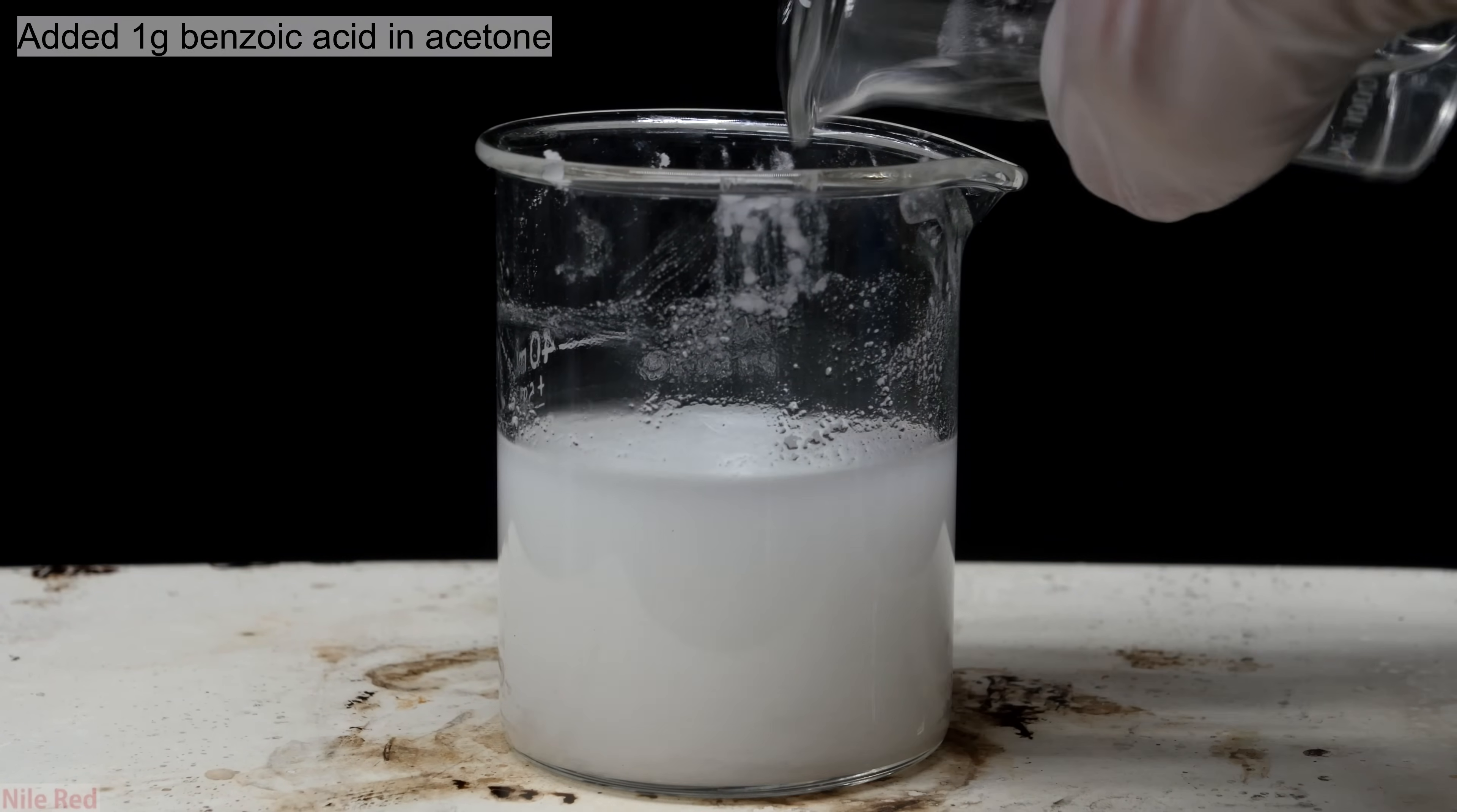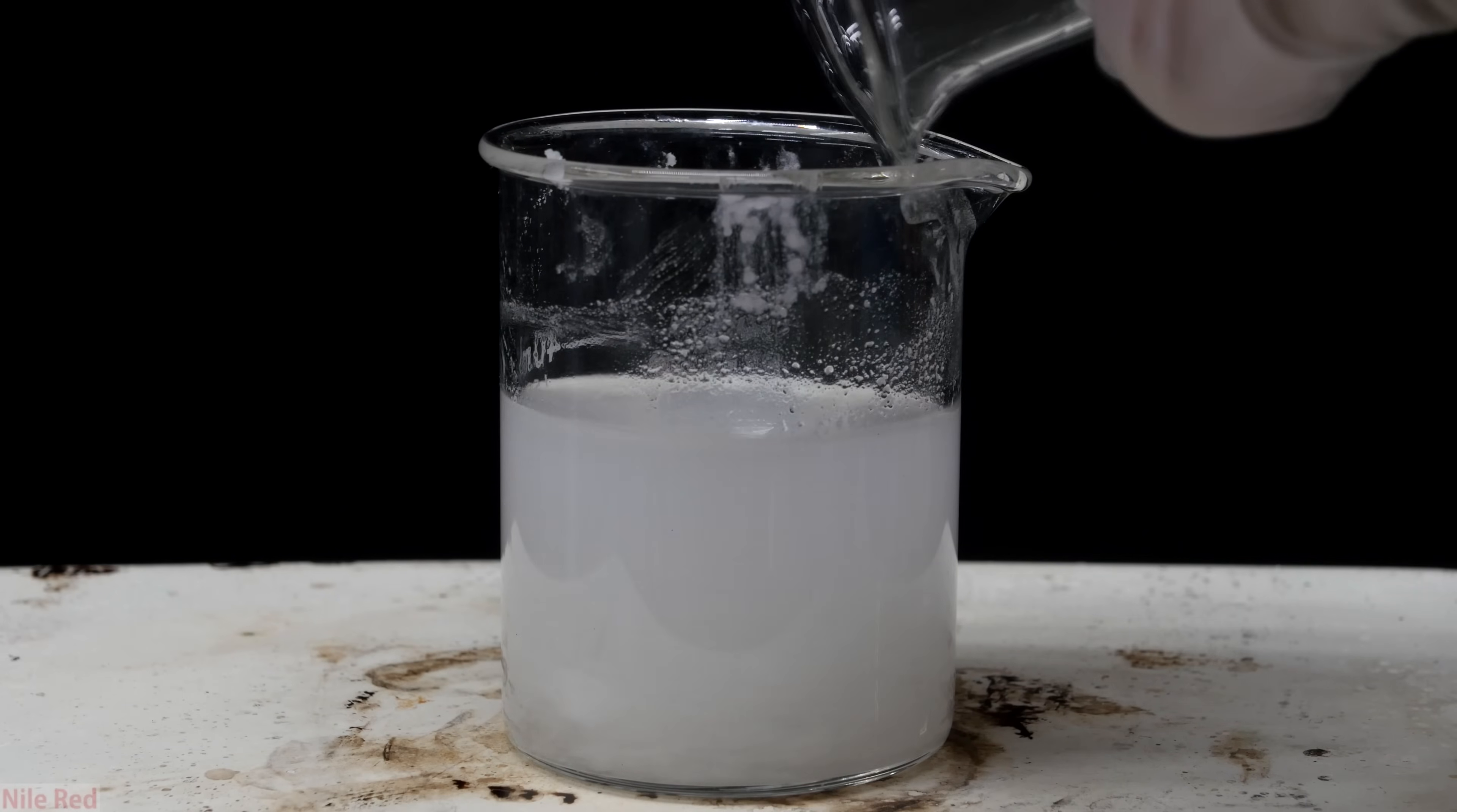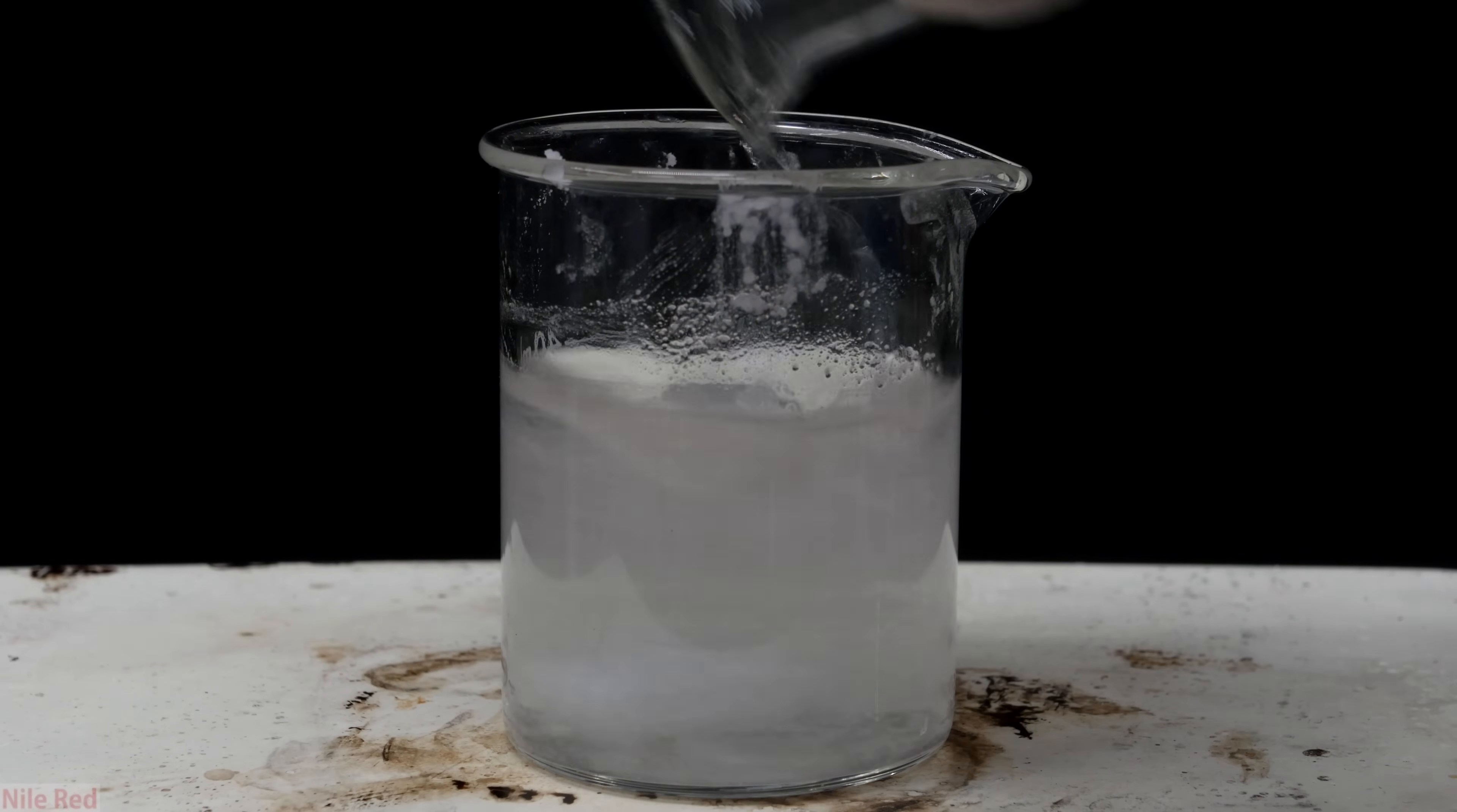With strong stirring, I added the benzoic acid to the denatonium hydroxide. A little bit of acetone was used to wash out any benzoic acid that might have remained in the beaker. What's interesting is that after it's added, it slowly starts to clear up. It doesn't clear up fully though, and it peaks out and then eventually starts to get cloudy again.